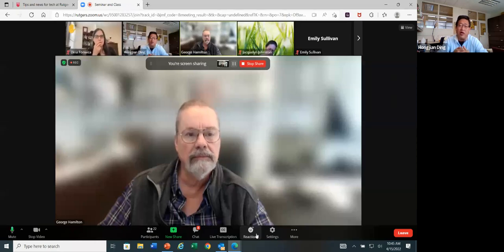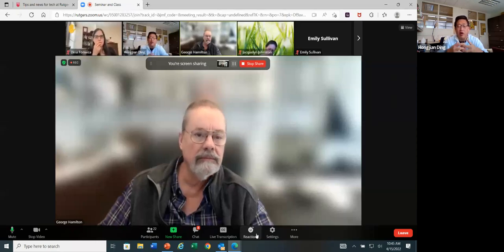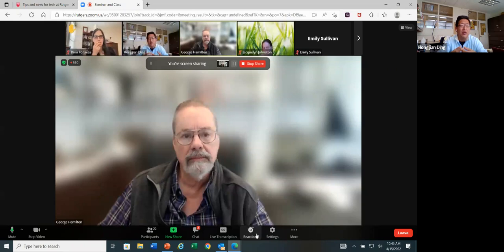But eventually, if the database is big enough, and for the common species, like right now we have 15 species, expanded to 50, that's on the list. We will not need human confirmation, because the system has already confirmed these 50 species. It's good enough. That's the current situation.